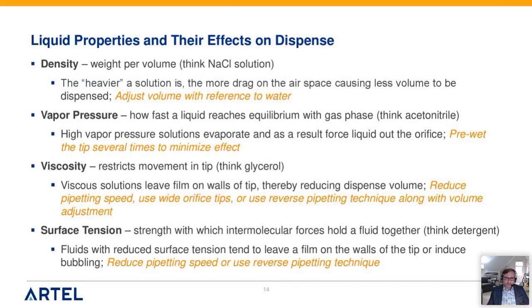Surface tension is another thing. And again, these are detergent type of solutions. The viscosities, maybe the glycerol PCR mix, if we think about that. So there's a number of factors that, regardless of the tools that you're using, are going to affect the dispense.